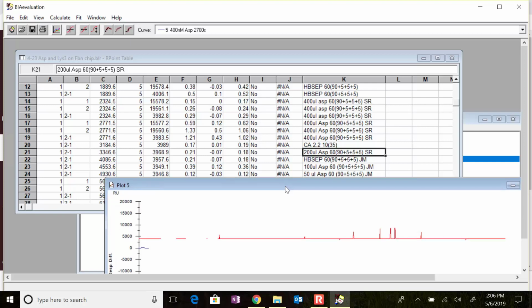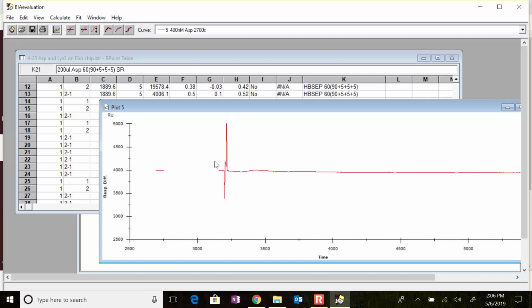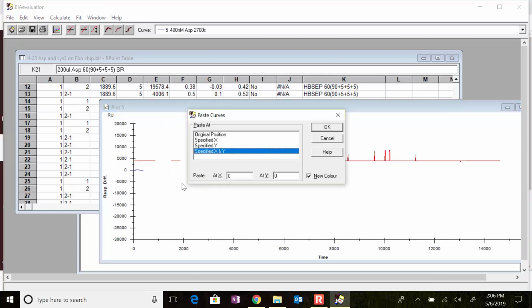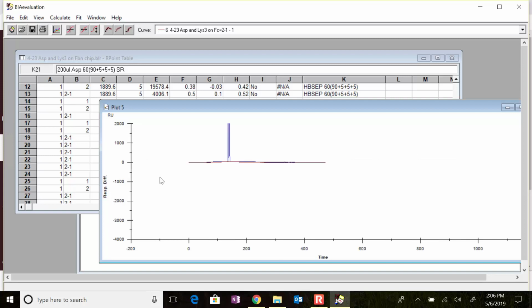You never know when it'll be useful. Okay. All right, so now we're going to go back out to the 3346. And there it is right there. And I'm pretty happy that with where it starts and stops that I can just do this. Collect a little bit back, Control X, Control V, 0, 0, new color, and here we are back here. Oh, the only problem is now it's overlapping the other one.